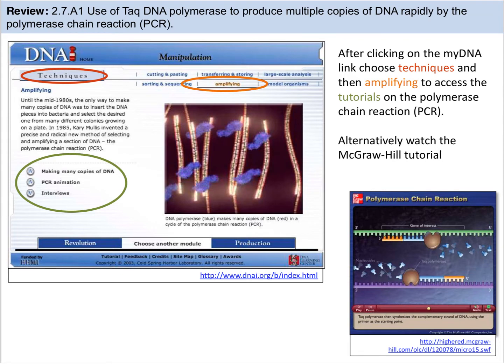So whenever we're dealing with DNA and trying to create, for example, genetically modified organisms by having the gene be cut with restriction enzymes, and then having the plasmid cut with the same restriction enzyme, then putting the plasmid and the gene together and using DNA ligase to make one solid new plasmid, going through this process of gene transfer, we don't do it once, we don't do it a dozen times, we don't even do it 100 times. We want to do it like 1,000 or so times because there's a very high probability that something goes wrong.